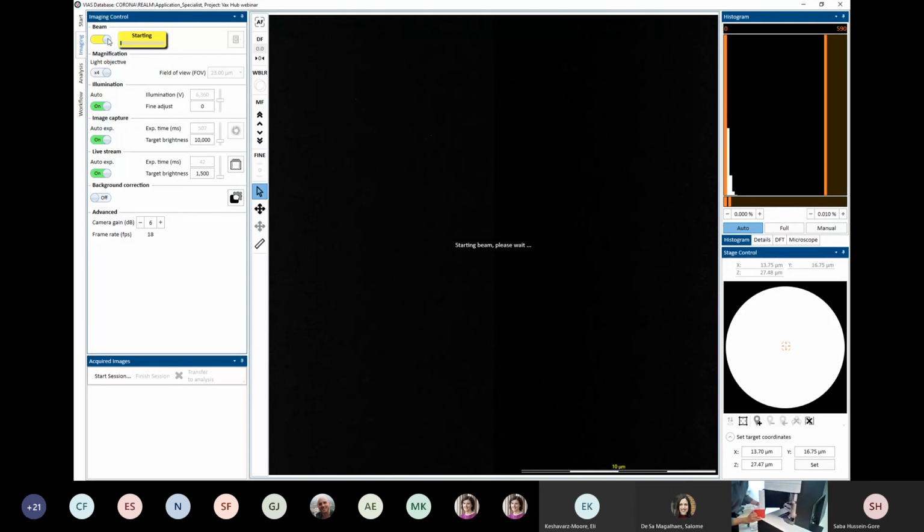If I open this up, this is the bit that we can move and control. We have two knobs here. This is for adjusting the apertures, and we have a little screw up here to control our YAG screen, which I'll get to in a bit. Those are the only things that you can move and change. So not very much really.